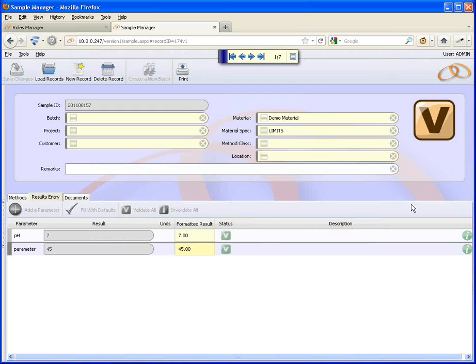And then if I go to validation and choose validated and approved, that's how I'd expect most of your samples to end up. So it goes from new, pending, begun, completed, validated, and then with a final approved status, so validated and approved in this case.